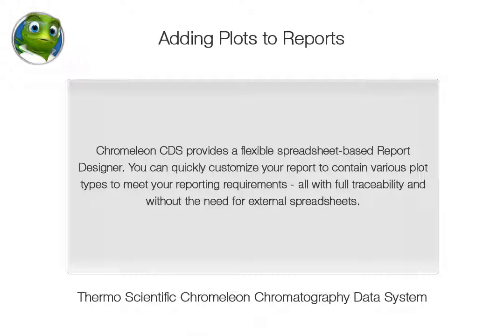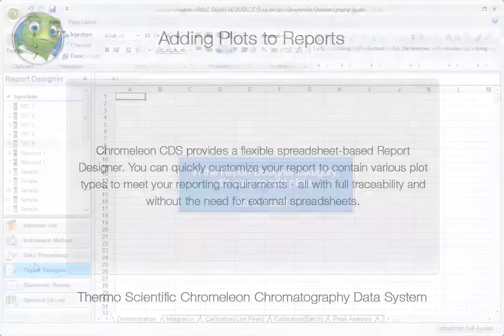Chromelion CDS provides a flexible spreadsheet-based report designer. You can quickly customize your report to contain various plot types to meet your reporting requirements, all with full traceability and without the need for external spreadsheets.